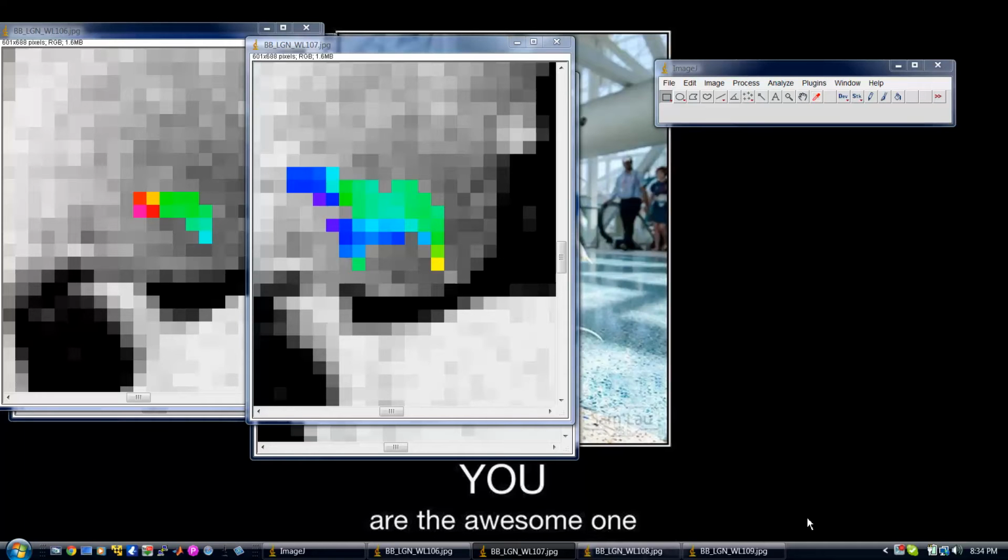I went over the internet and tried to find some sort of tutorial on this program called ImageJ on how I could count voxels, and apparently there wasn't one out on YouTube. I couldn't even really find any tutorial at all in PDF form or anything else, so I had to figure it out for myself, and since I did, I figured I would share it with the rest of the world, and hopefully someone might find it of benefit in the future years to come.